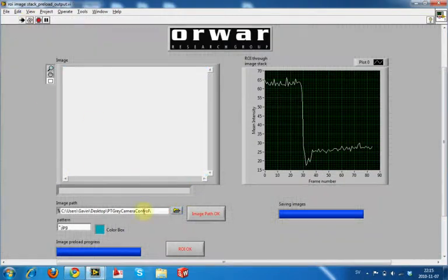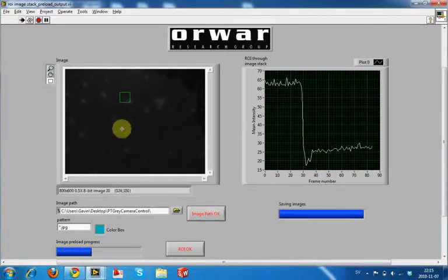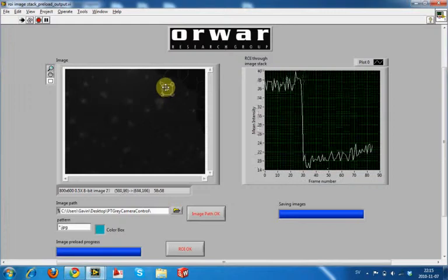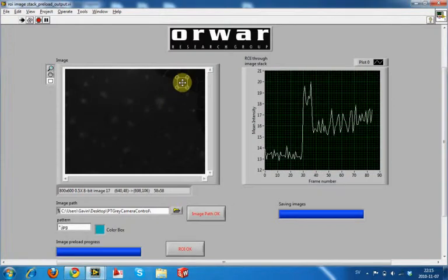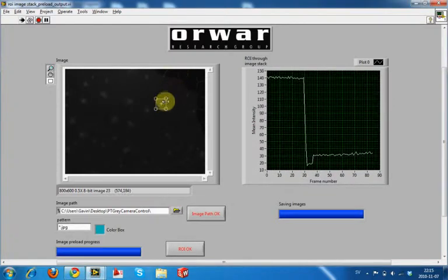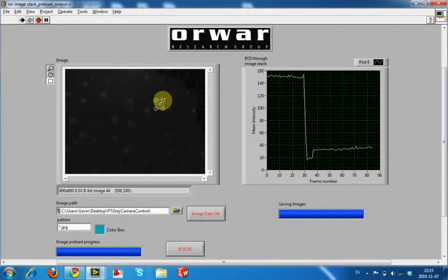If this is right, then hit OK. And we have our little ROI tool. And if we're monitoring over here, we should be able to see as we move around, it moves around in real time, showing us how the details change in that region of interest. But I think we're going to hang around here. That looks quite interesting. This color seemed quite nice to me.